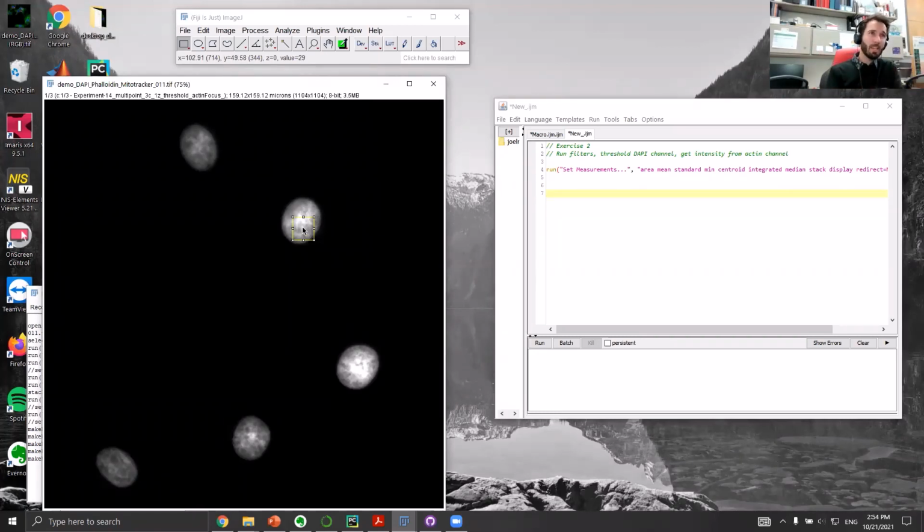So in terms of interpreting that, this is really tenuous, and be very, very careful about how you do this. The mean is a little bit more like the concentration of fluorophore, sort of, and the integrated density is like the abundance, more akin to how many fluorophores are there. Again, it's difficult to make these direct parallels, and you have to be very, very careful when you try to do this. You have to have a lot of controls to be able to make these types of claims. But just generally speaking, it's total amount versus average amount.